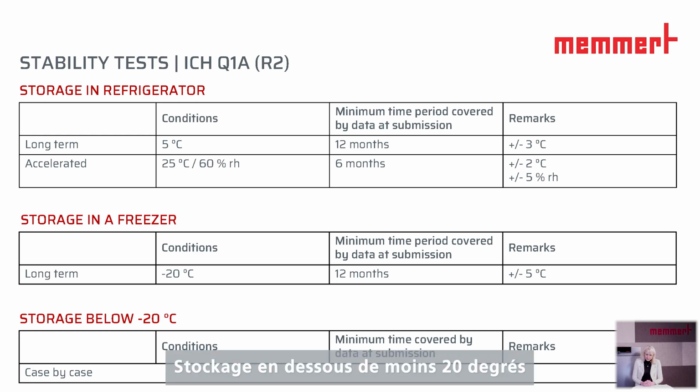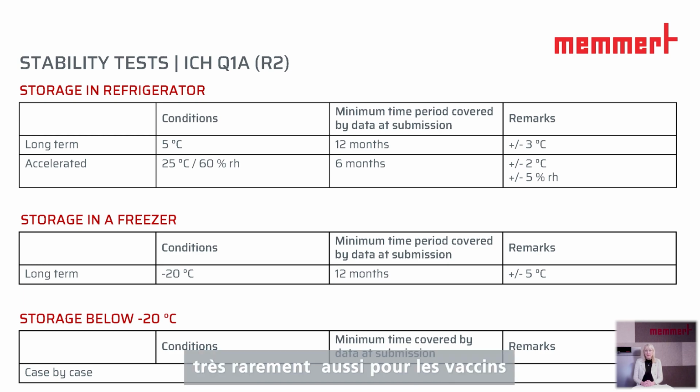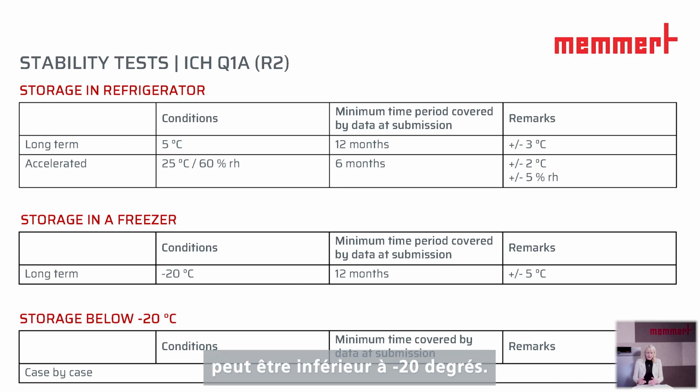And there's storage below minus 20 degrees. That is case by case, is very seldom. That is also for vaccines. So here, for example, it could also be lower than this minus 20 degrees.